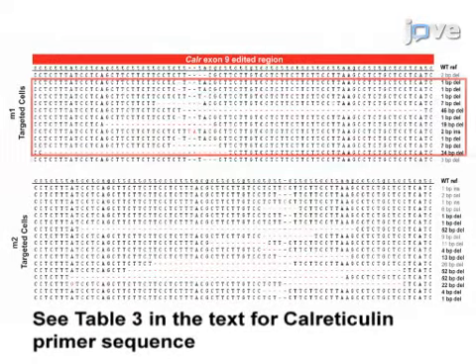Sequencing results confirm the on-target editing of endogenous calreticulin exon 9 in calreticulin-targeted BaF3 thrombopoietin receptor Cas9 cells, using the M1 and M2 single-guide RNA. The +1 base pair frameshift mutations are indicated in black.